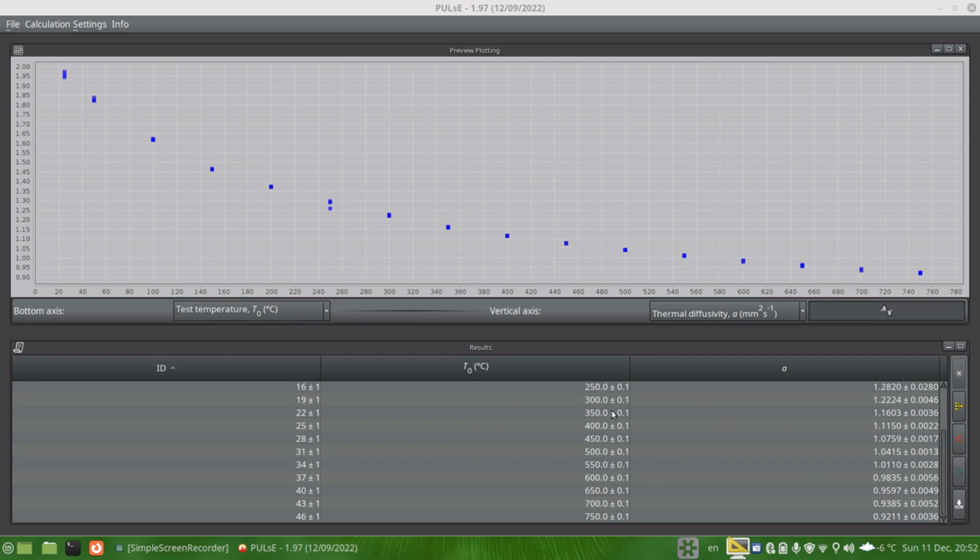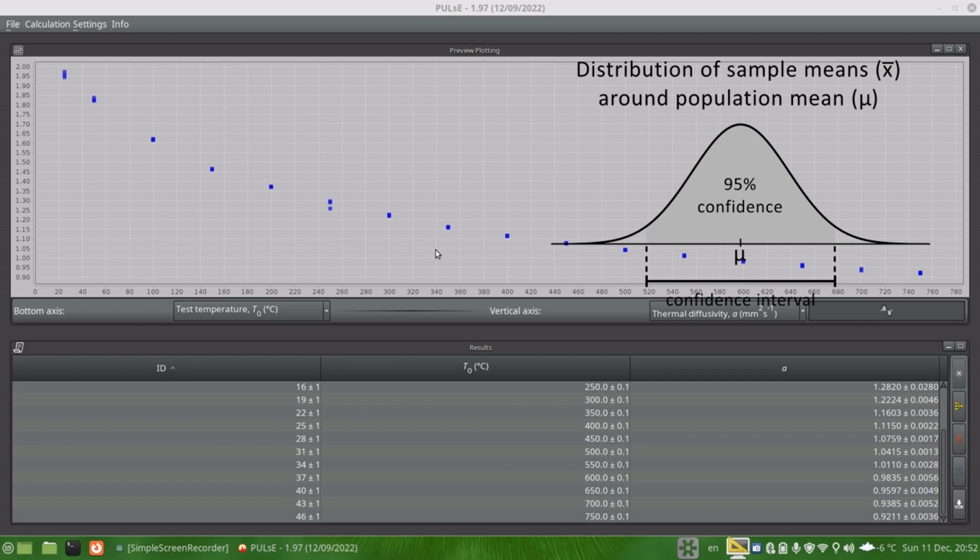Then you might see that something has happened to the table below. It has now changed to the view for the mean values, and also an error value appears. So this is actually the real error, which is calculated given the confidence level of 0.95, and the span of the error is actually equal to the actual length of the confidence interval.